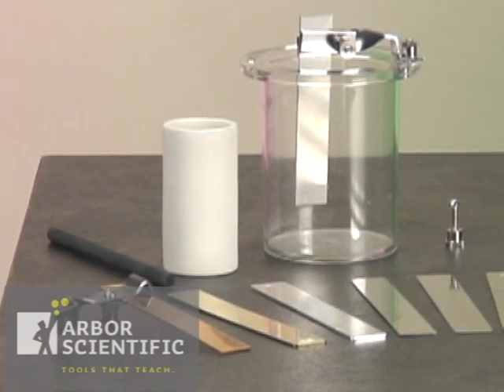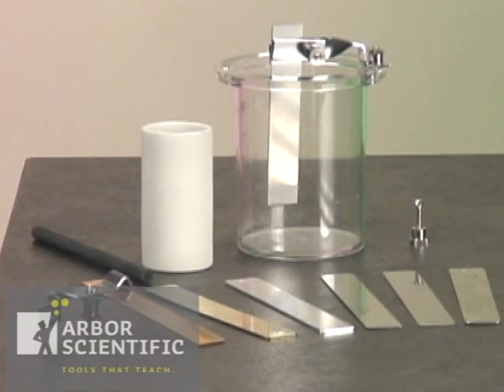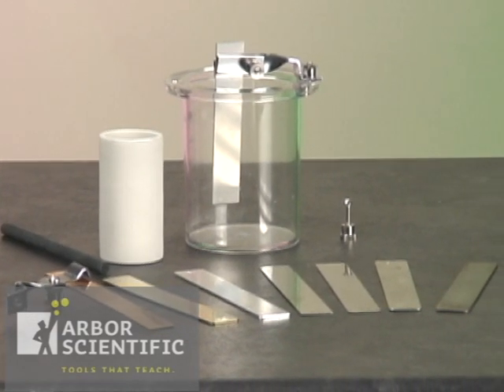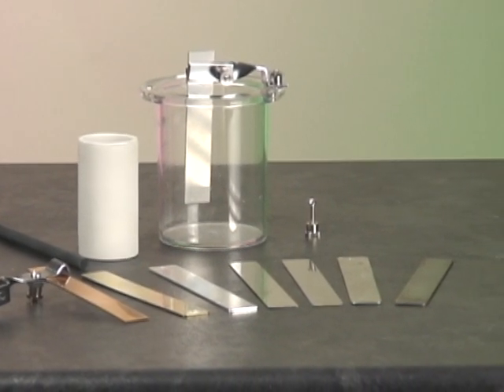The voltaic cell demonstrates some of the chemical reactions that can be used to create electricity. Students can also personally observe some of the evidence that the reaction is taking place.